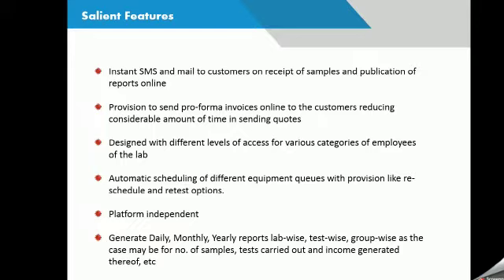Data sharing across the system is easy. LIMS can be interfaced with any internal business-specific software. Extensive report formats are provided. Using this, we can generate daily, monthly, yearly reports, lab-wise, test-wise, group-wise reports for the number of samples, tests and income.